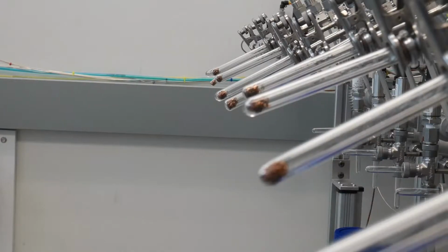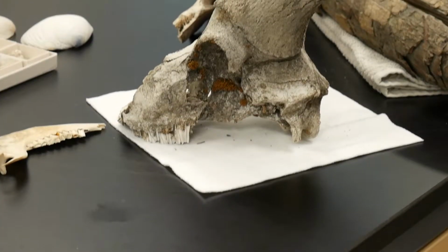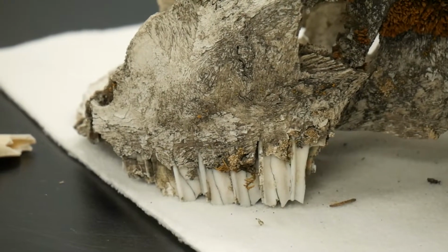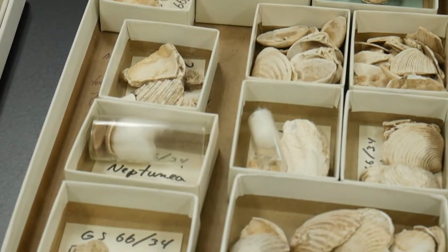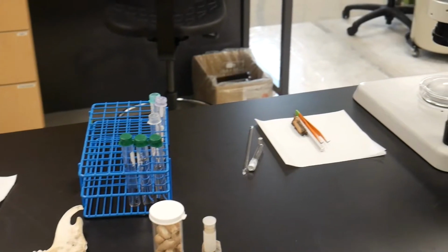My name is Sarah Marcelli. I'm the laboratory manager at the AE Lalonde Radiocarbon Prep Lab. I work with all sorts of different material types in helping to prepare them for analysis on the AMS, from ivory to bone, shells and wood. We also do environmental analyses, water and gases, and there are other different radioisotopes that our lab can process, but today I'll be talking a little bit about what we do in the radiocarbon lab.